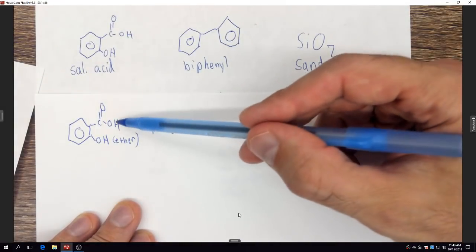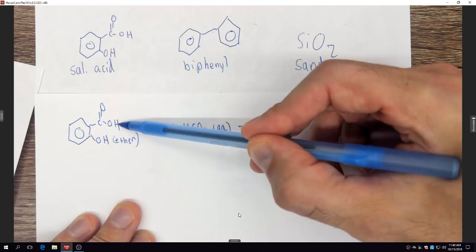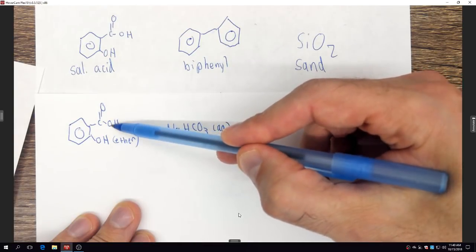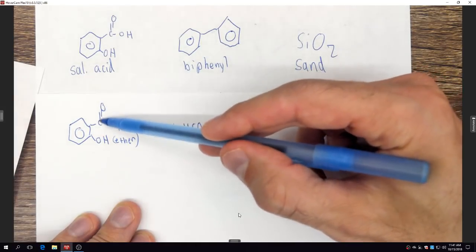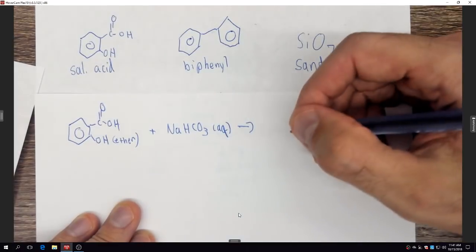The simplest reason is this is a carboxylic acid, and carboxylic acids are acids which donate protons. The less simple reason is you have resonance stabilization between this oxygen and this oxygen, which makes it the most stable when this hydrogen leaves, because that negative charge can be shared through resonance between this one and this one. But that's the basic idea.